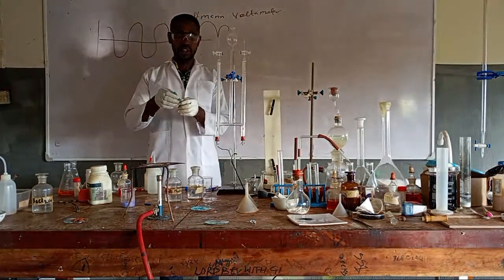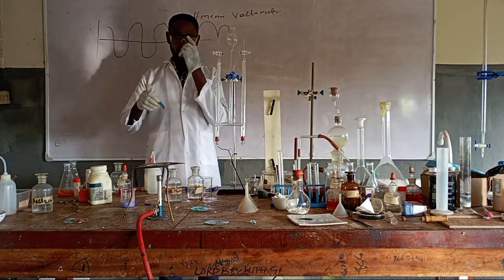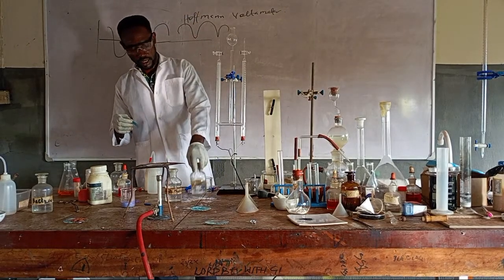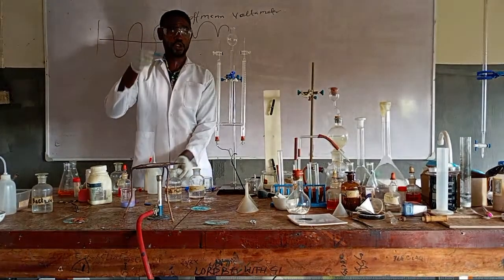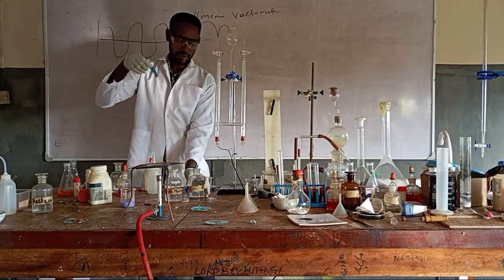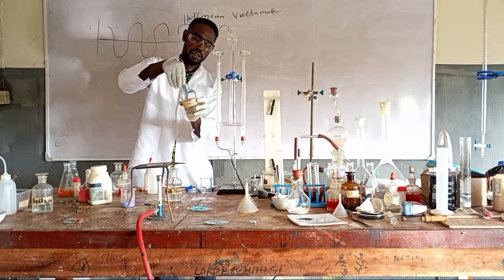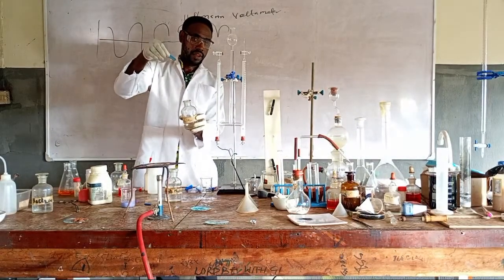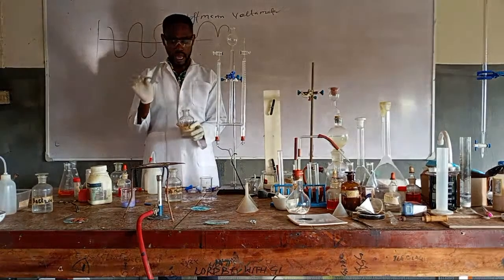If you place this on a leaf, it will turn pink, showing that water is lost from plants by transpiration. Okay, remember, if this is litmus paper, it's supposed not to change color in base. Very correct. But to tell you it's not litmus, see, it has turned pink. Not because of the base, but because of the water present.